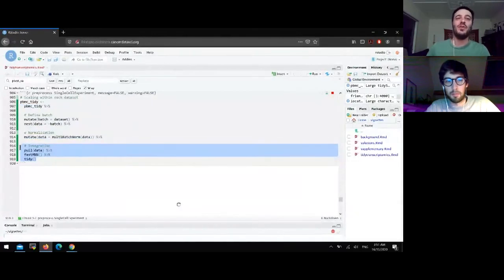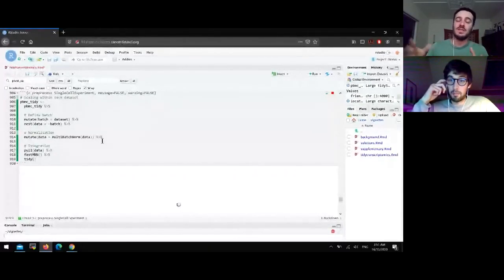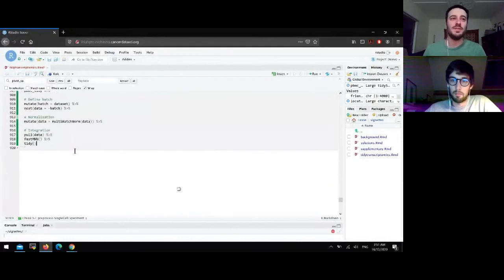And just here, we go out a bit, producing a list of data sets and then putting that back together. But this is the actual effect of accounting for this technical variability, producing adjusted counts as well as producing reduced dimensions that take this technical variability into account.